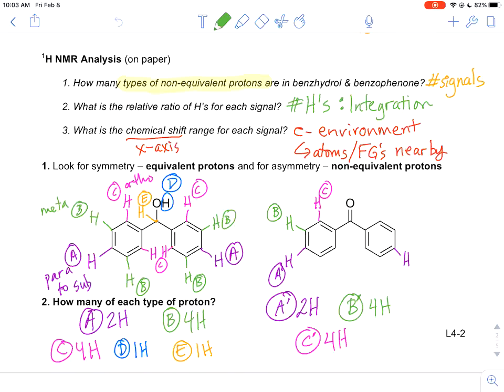Hello and welcome to the supplement to today's lecture. This is actually catching up from lecture 4, so you can join me on page 2 of your lecture 4 notes. I'm just going to review what we already did go over in lecture 4 on proton NMR analysis.